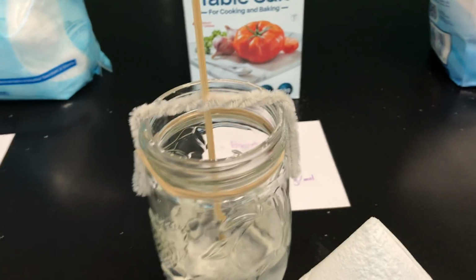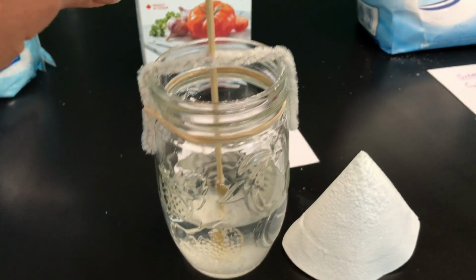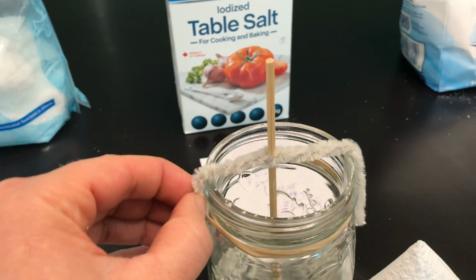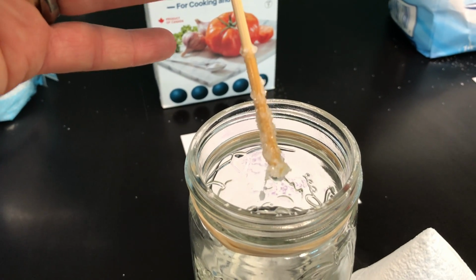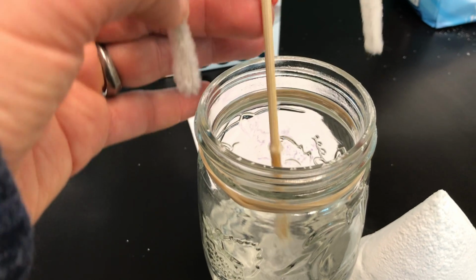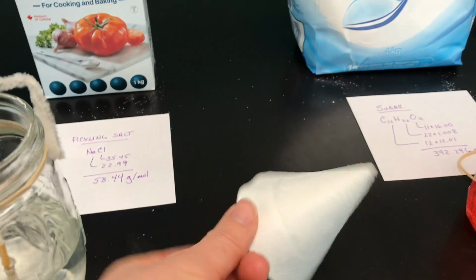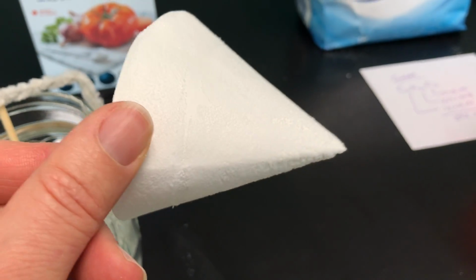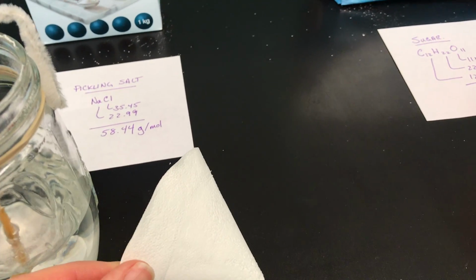The salt, I was a little curious about this one because I had used iodized salt as opposed to non-iodized salt, like the instructions said. But regardless, I did get a little bit of success, and I actually got a little bit of crystallization on my nucleation point, or on that stick. Also on the filter, curiously, there were crystals inside the filter and outside the filter. So as the solution was going through that filter, it was actually crystallizing.